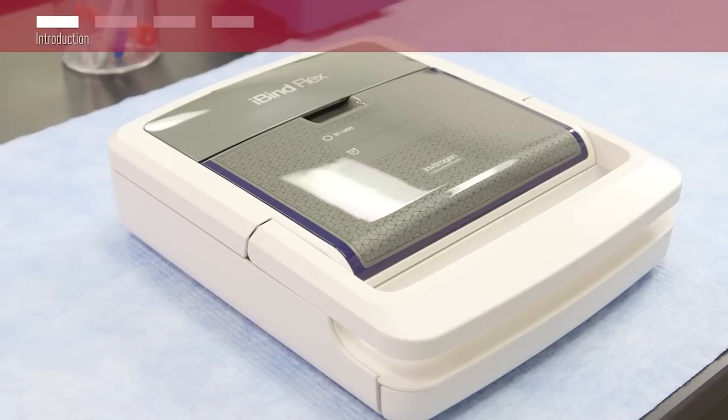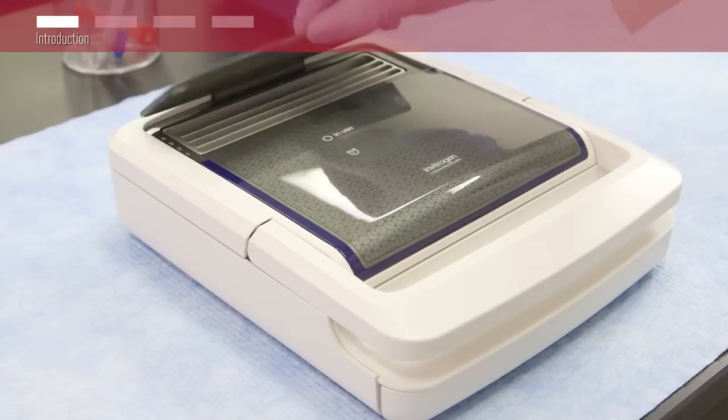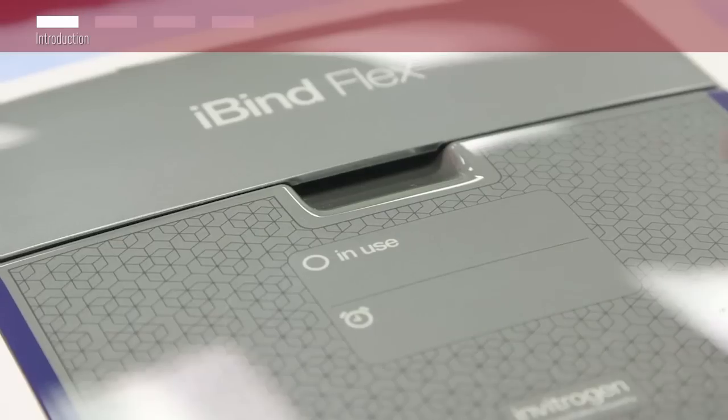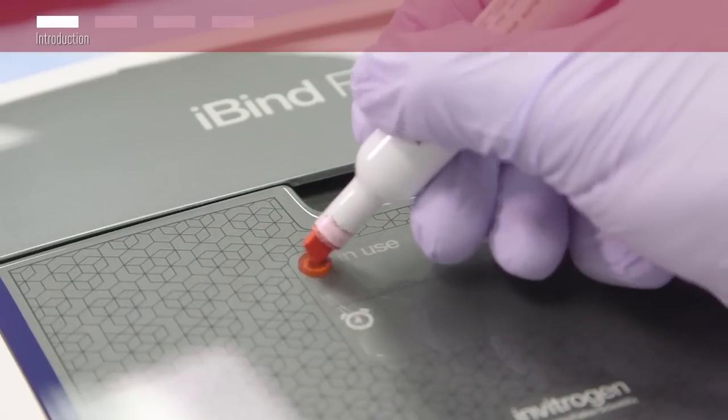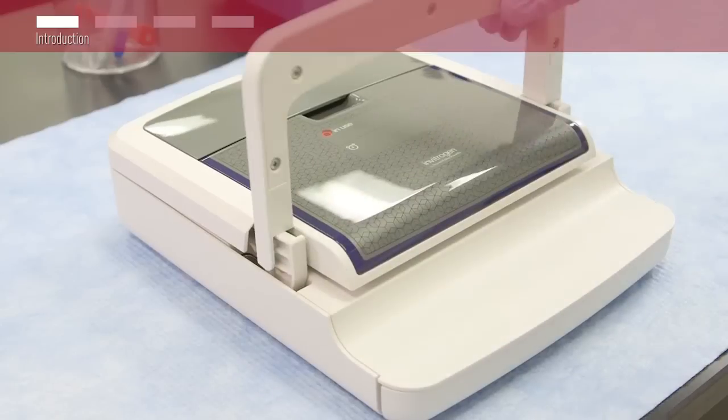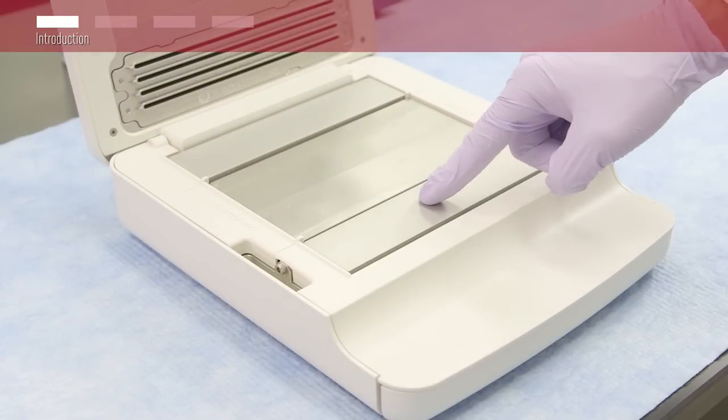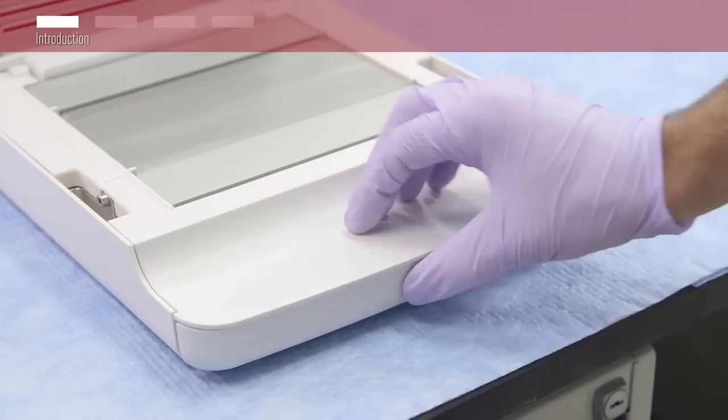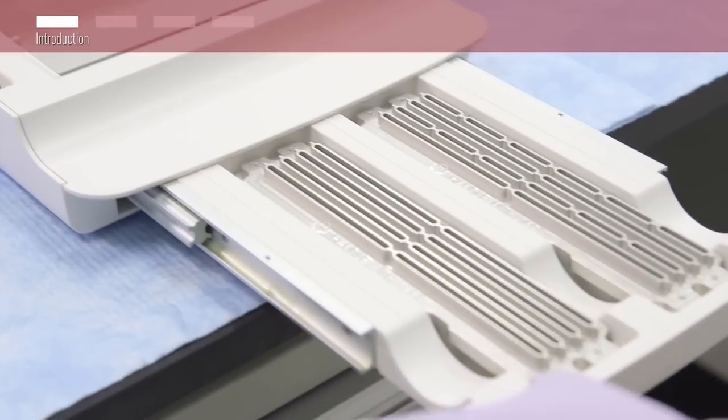The iBind Flex device consists of a liquid door where reagents are loaded, a dry erase area to notate in use and start time, a main latch handle and lid, two spring-loaded plates to hold the card, and a drawer to store the unused well inserts.